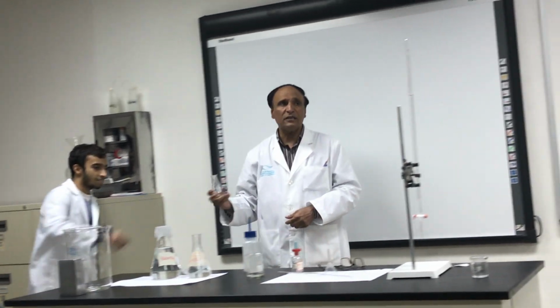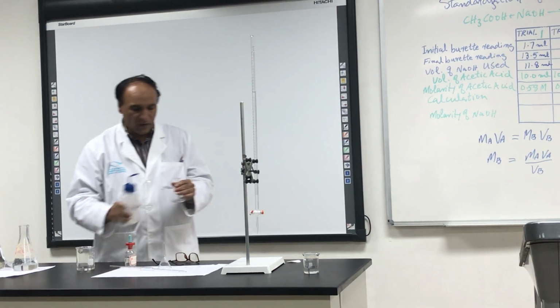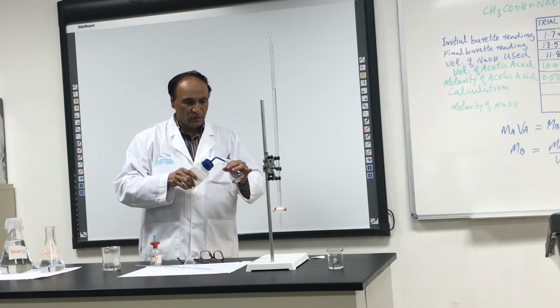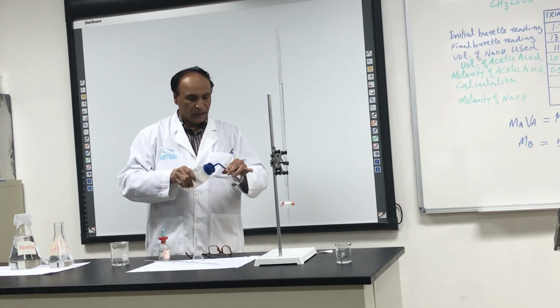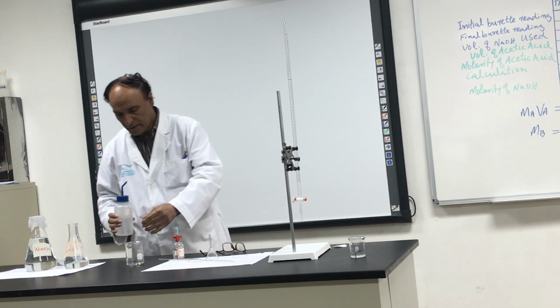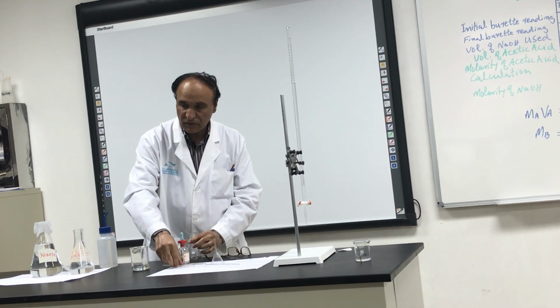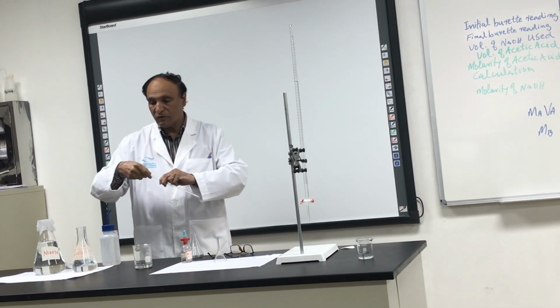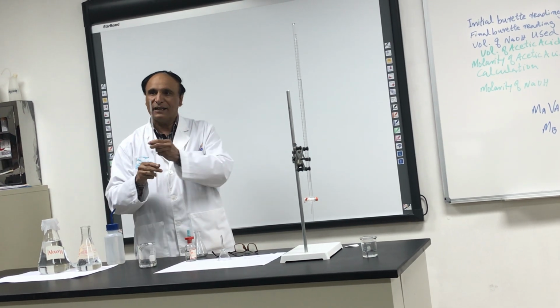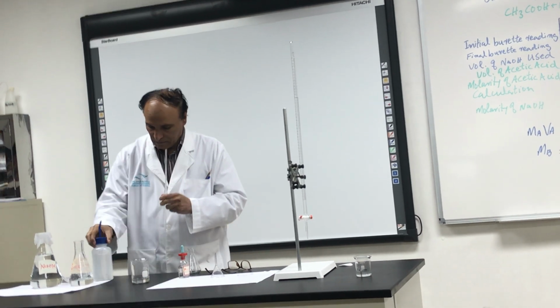Okay. Now this is washed with the tap water. Look over here. Now this time, no talking boys, you wash it with the distilled water. And this is washed. I will take this one. No need to wash with the acetic acid because already we have done it.